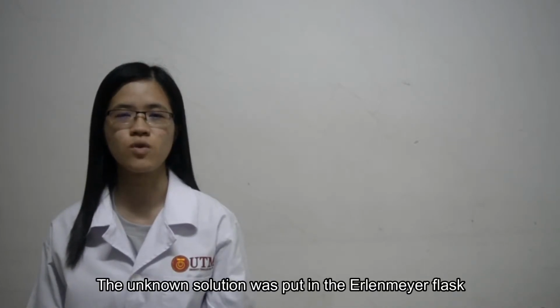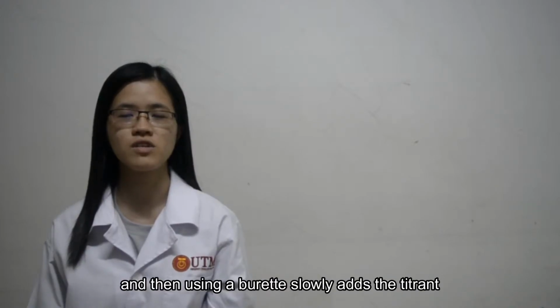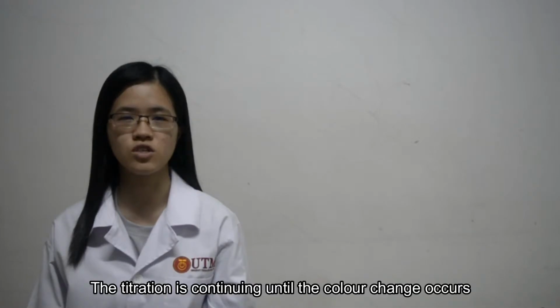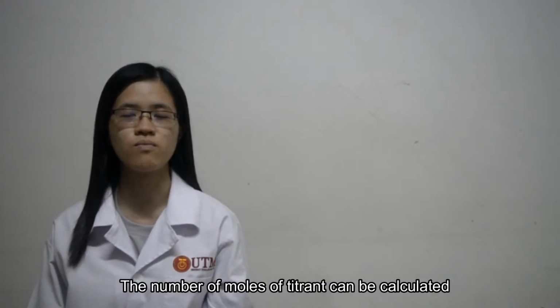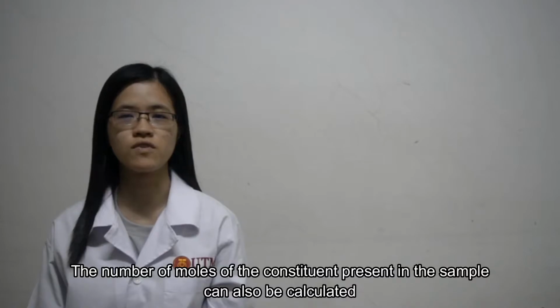The unknown solution is put in the Erlenmeyer flask and then, using a burette, the titrant is slowly added. The titration continues until the color change occurs. The change of color indicates the reaction is complete. Since the molarity of the standard solution is known, the number of moles of titrant can be calculated. Based on the equation of the reaction, the number of moles of the constituent present in the sample can also be calculated.